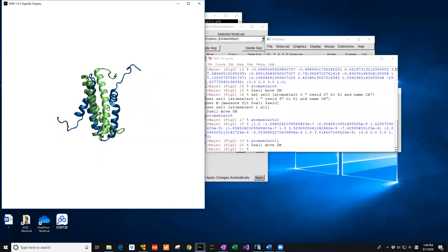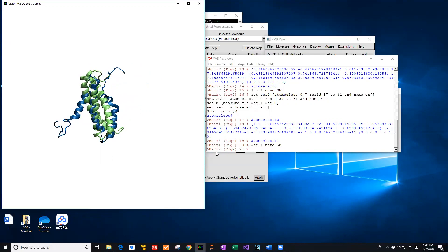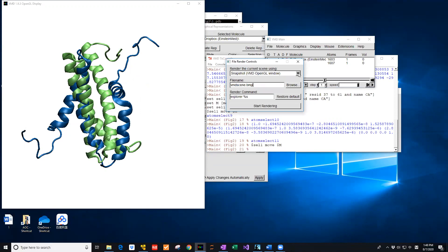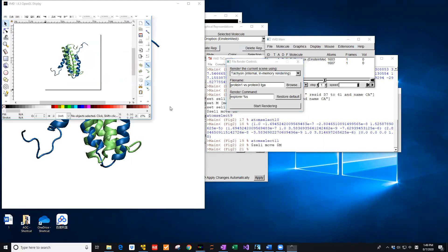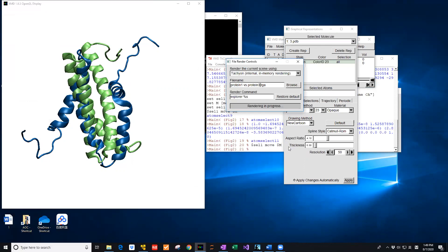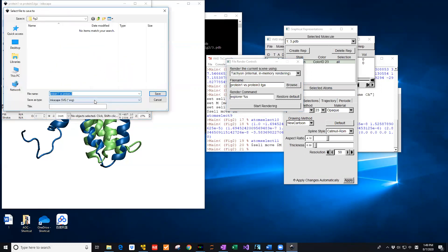With helix-2 aligned together, we can compare helix-1 and helix-3 and see the difference. If you want to take a picture, make it bigger. You can also increase the resolution of the two proteins. Let's render it once more — save as PDF.